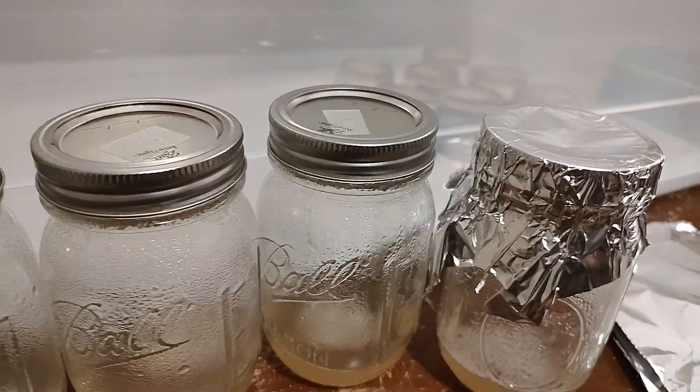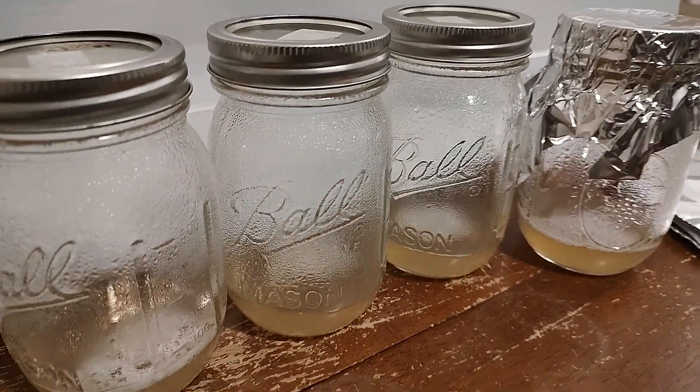So again, 45 minutes at 15 psi on the slurry recipe.